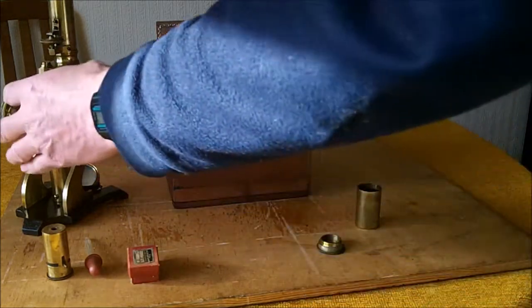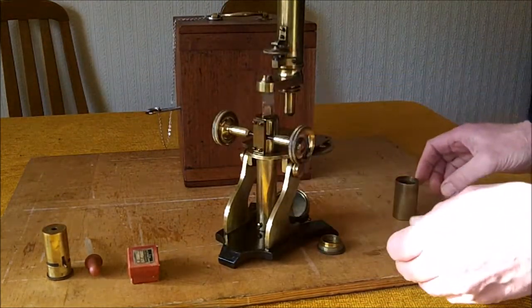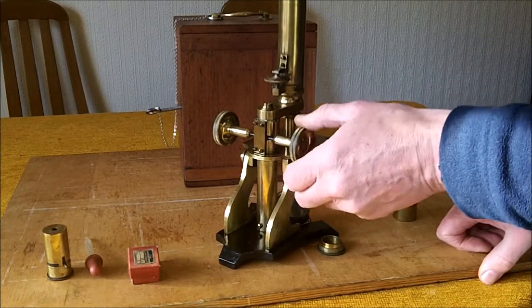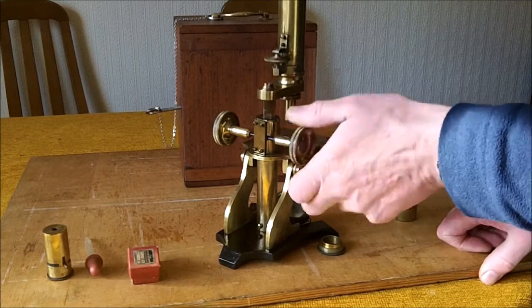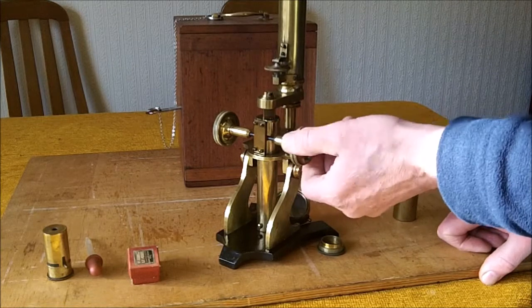This microscope now functions properly, and the adjustment has been restored to a smooth working action.